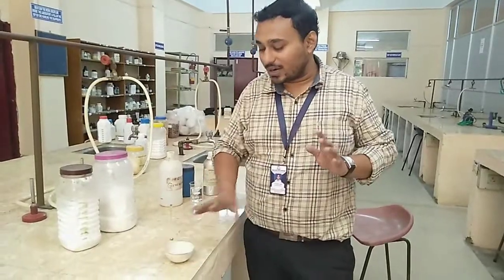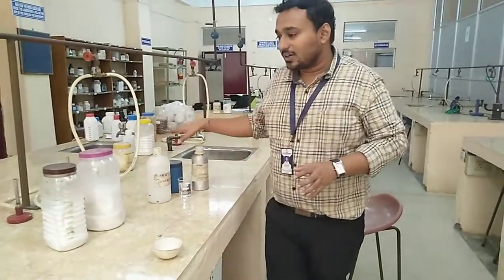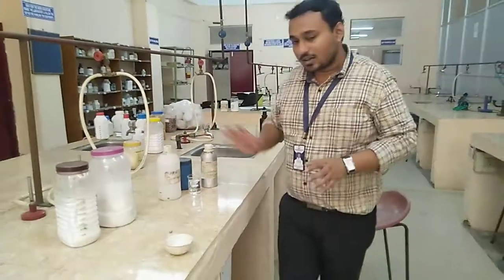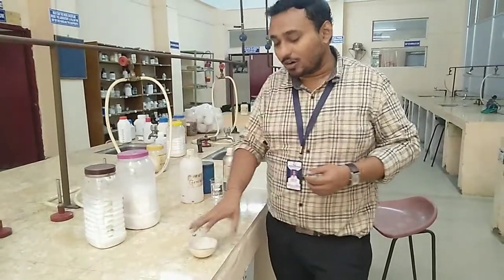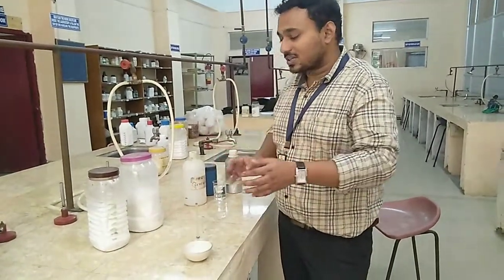After proper mixing, we take another porcelain dish. In this second porcelain dish, we are adding triethanolamine, then glycerin, and purified water — all are mixed here. After mixing, we again use a water bath for heating up to 70 degrees Celsius, until both mixtures are mixed properly and in liquid form.